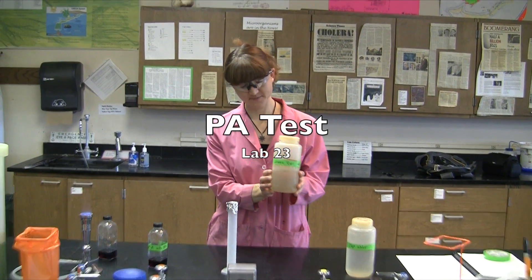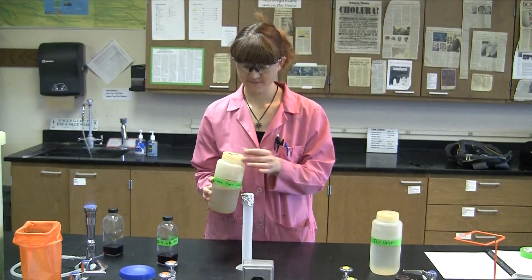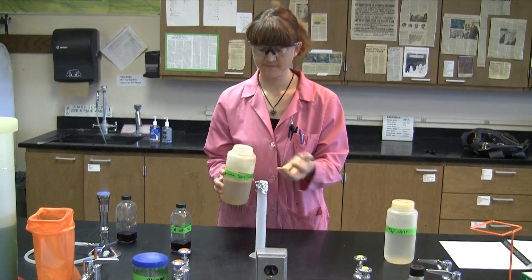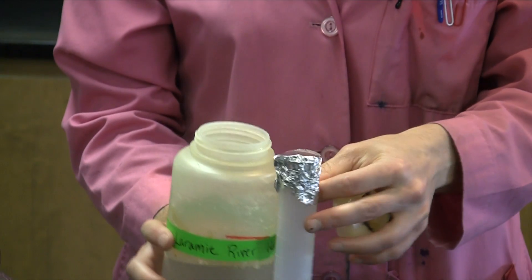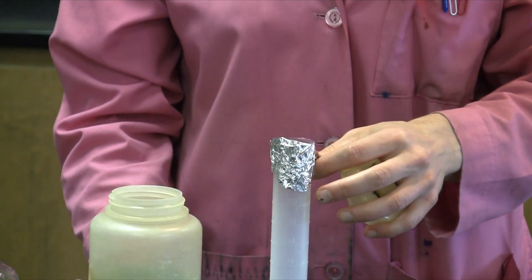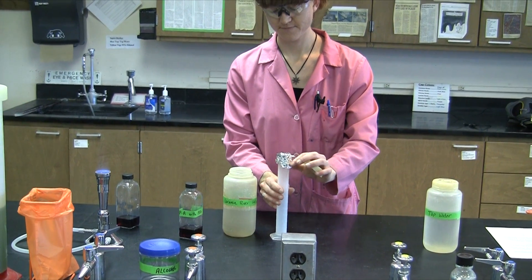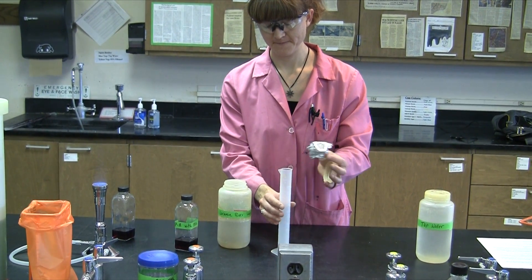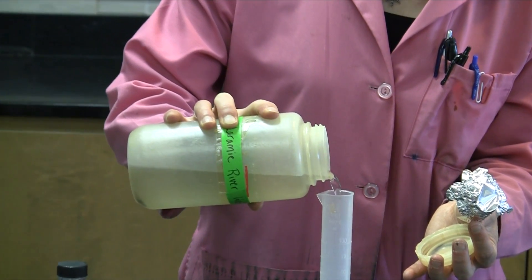The PA test is the most common way to quickly and qualitatively assay large volumes of water. In this particular example, we're using Laramie River water. To begin with, we'll simply pour 100 milliliters of your water sample into a sterile graduated cylinder. We always measure water per 100 milliliters, and that's how we quantitate the number of coliforms.